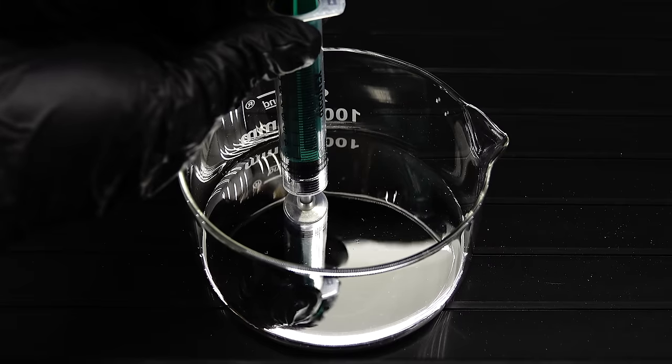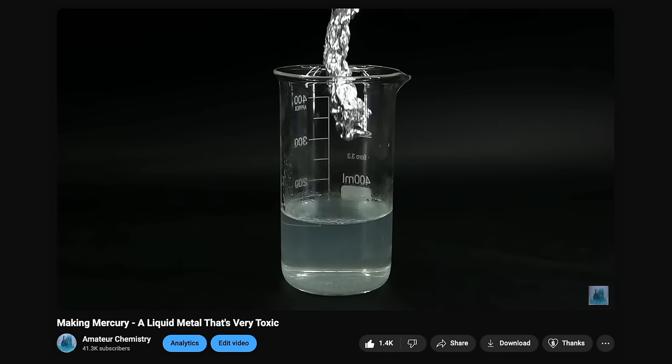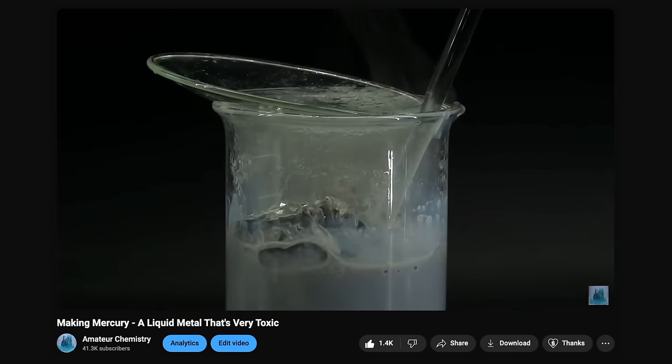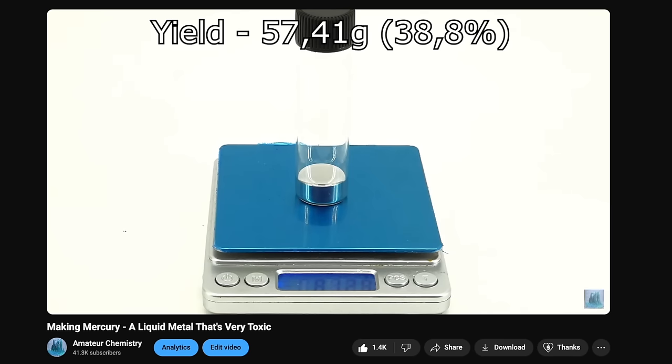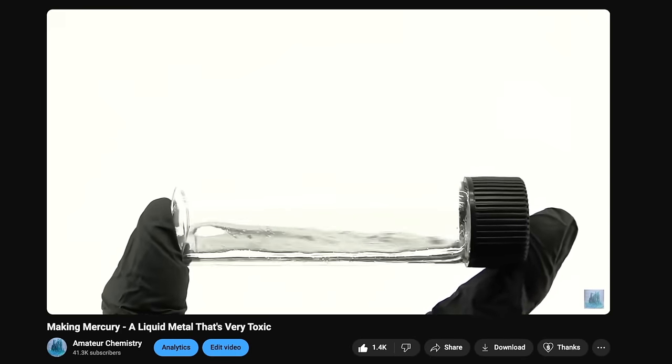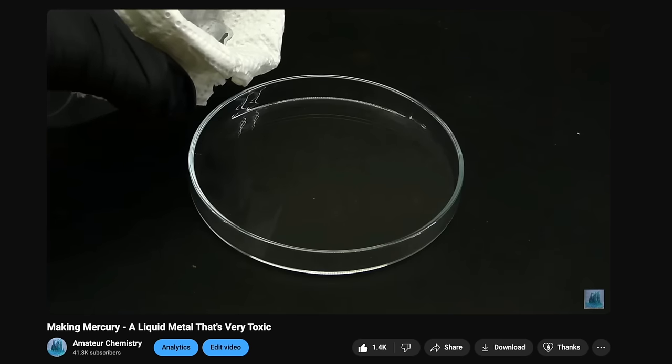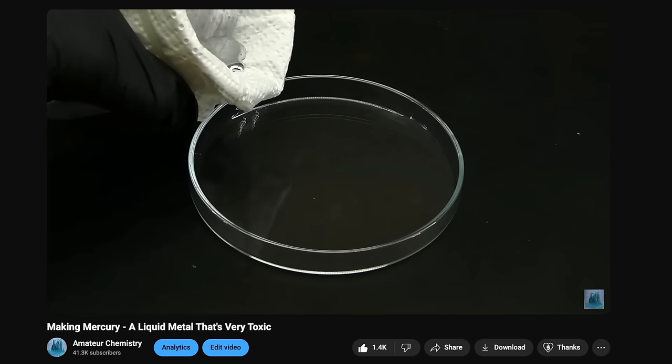I actually already made a video about it where I make it from a chemical called Mercury Chloride. In that video, I managed to produce about 60 grams of impure mercury, through some great struggle and potential exposure to Mercury Chloride's extreme toxicity, which put a stop to my mercury-related projects for a while. That's because, toxicity aside, 60 grams is really not much to work with, considering mercury's extreme density, and before using it for anything, I would have to purify it.